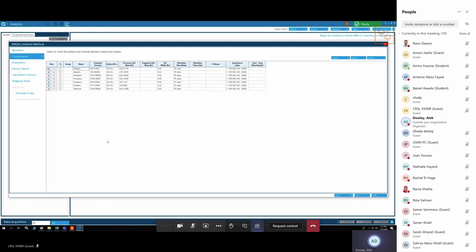Okay, so that's what you need as a bare minimum. You see here you have the adduct, the charge. If you know, for example, that you're dealing with an ammonium adduct or something, you can always find that in the list here and change it. These guys all make protonated ions, so that's okay. Now we have the precursor mass filled out automatically. That is the monoisotopic exact mass of the charged species, and it got that from the chemical formula.